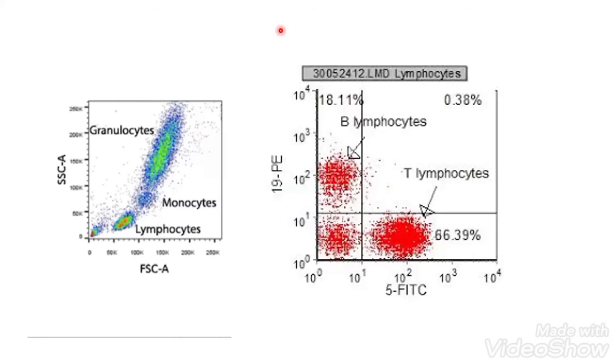So when we can do everything in real time and everything with live cells, then why not increase the throughput of the experiments, and why not utilize the technology? So what you are requiring is the simple knowledge of some physics of scattering, some chemistry, that what is the fluorescence, where it will be emission, where it will be absorbance, as well as fundamentals of biology, that which cells are expressing which protein, and then you are good.